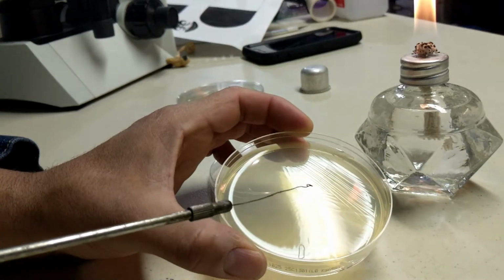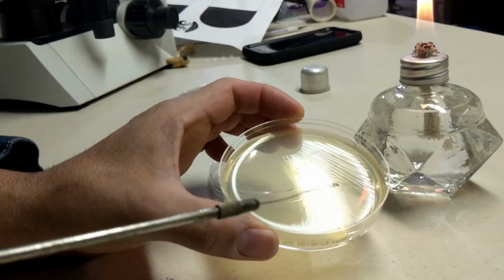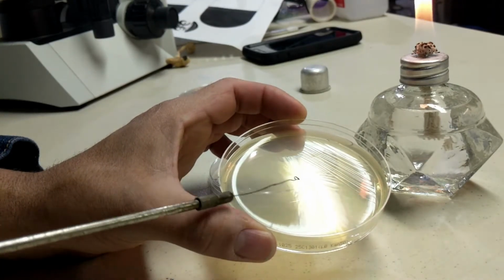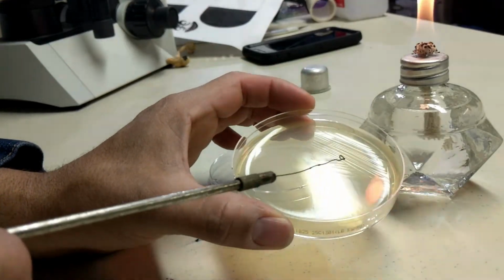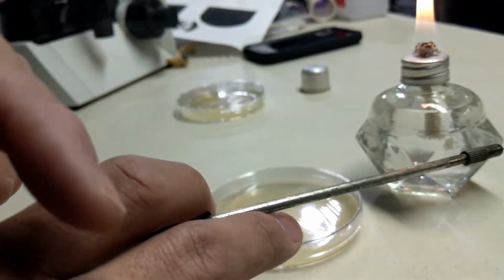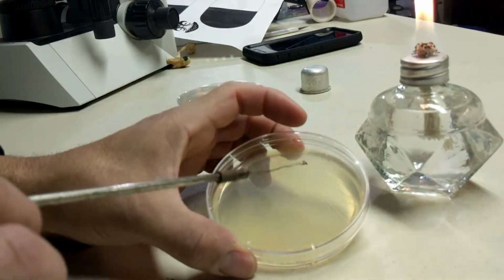So if you can see there the streaks. There's nothing in here, nothing in here, nothing here. Remember, we're going to have 4 quadrants, imaginary quadrants. So this is the first one, right? So there's no marks in here. Okay, let's close it. Now, would you go back to your culture? No. Why? Because you already inoculated that in there.